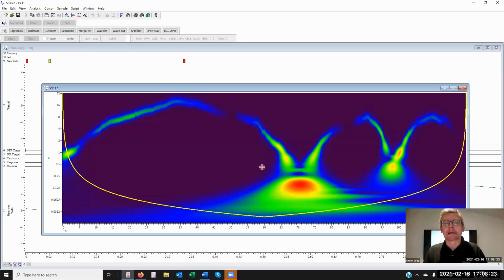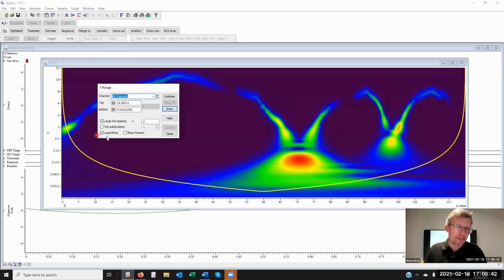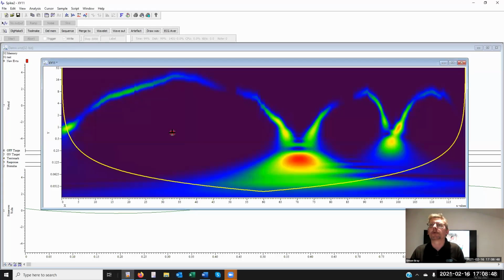We're looking at frequency information in this view. Again, using an XY view as the viewer, but this is an image that's been produced by the script and has been posted into this window. And you can see, I think, that we've got a logarithmic y-axis display there as well. Okay, so just a taster of what a script could do.